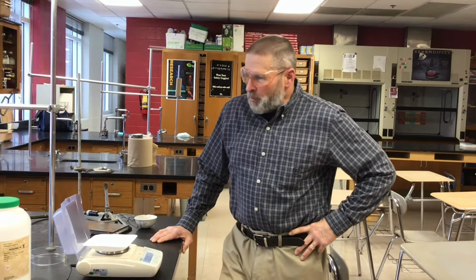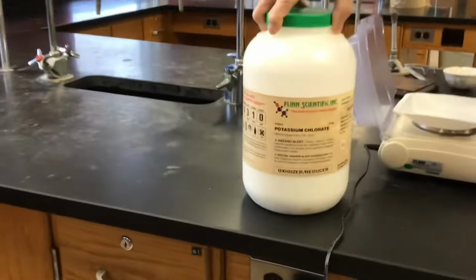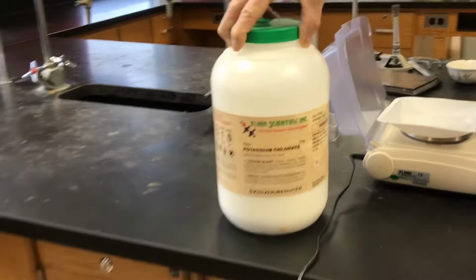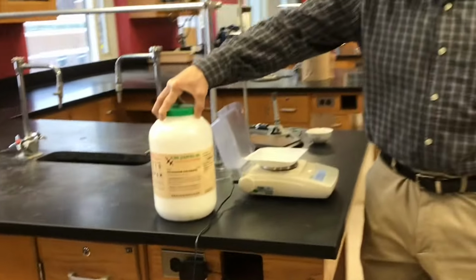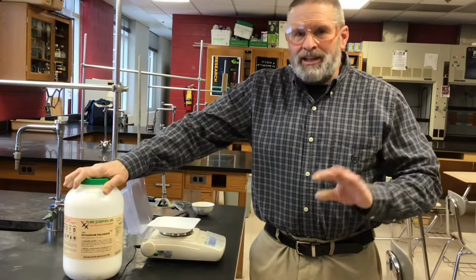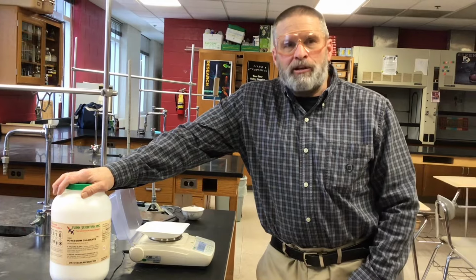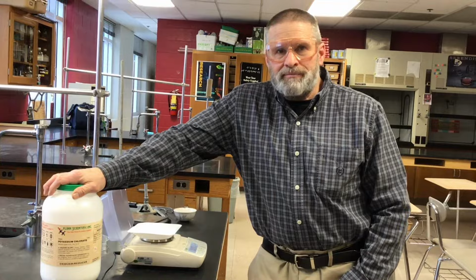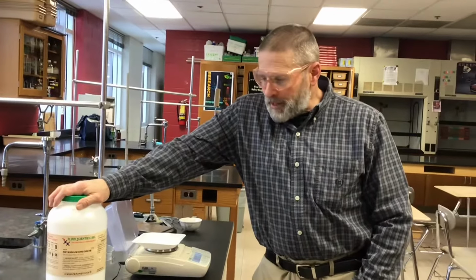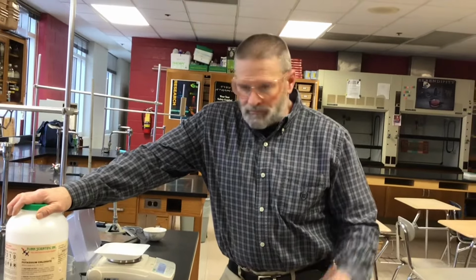So, let's see. What we're using is potassium chlorate. We're going to heat this up, and it's going to decompose. We can use that decomposition and the change in mass that occurs to help us calculate a mass percent composition. That's the basic idea here. There's 3 elements in potassium chlorate. And I think we only want one of the 3. If we can find the percent of oxygen, then that would be fine.